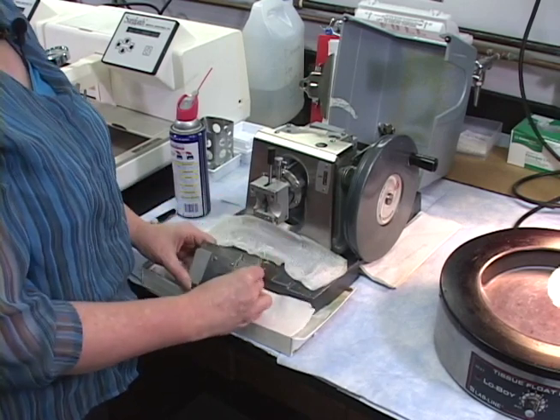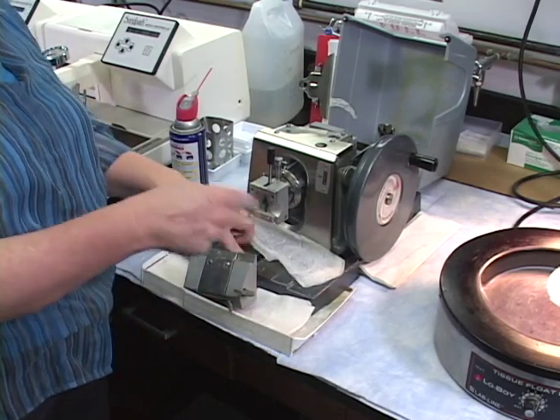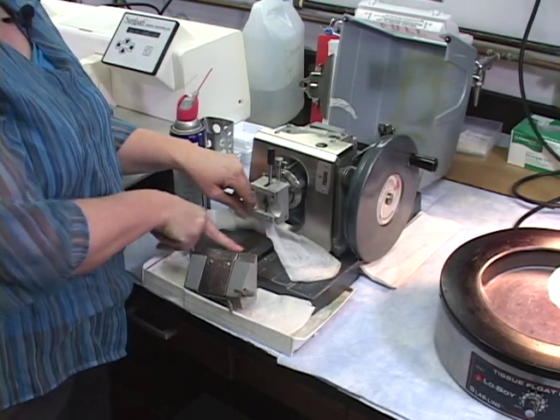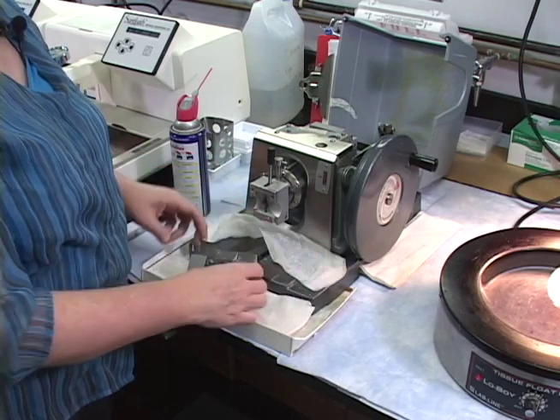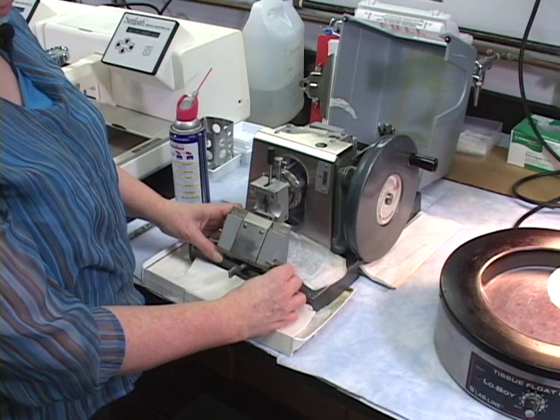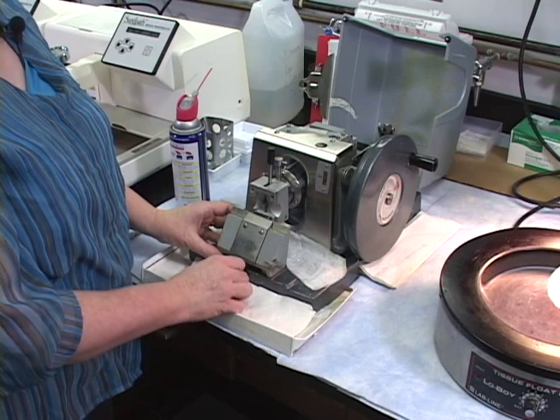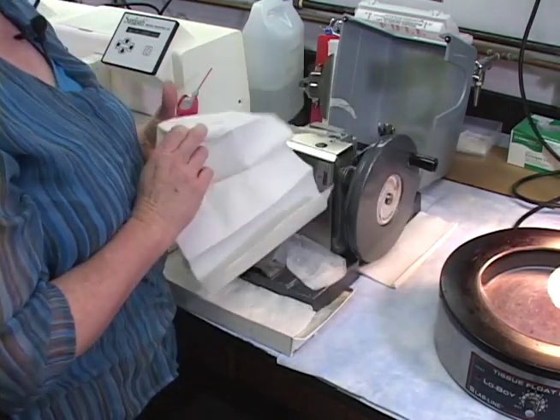This also, occasionally, you don't want it to get rusty from water that may drip down as you're bringing the samples back and forth. So once in a while, I remember to oil or grease this a little bit too, maybe once a month or so. It's really not complicated. Once you get used to this, in maybe about 2 minutes you can have this all completely oiled and done. I'm just going into great detail for these purposes.